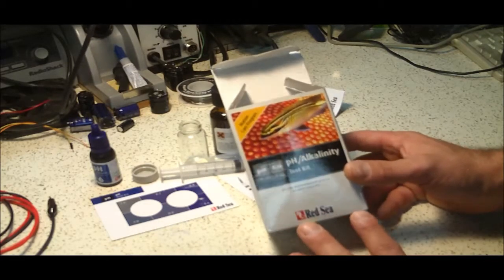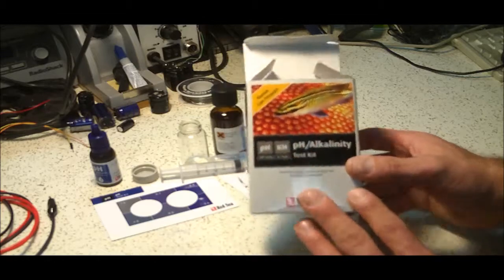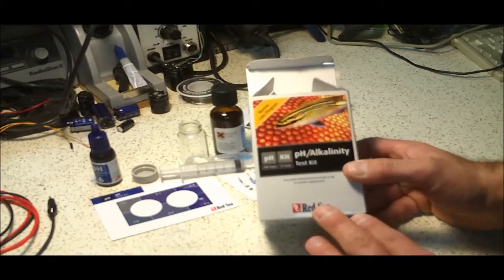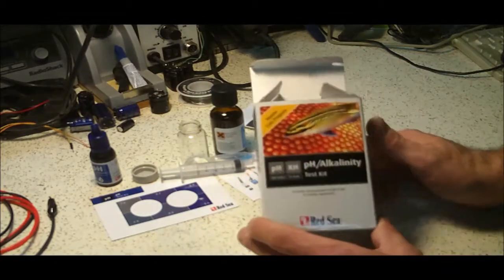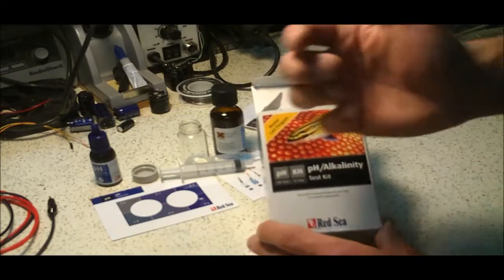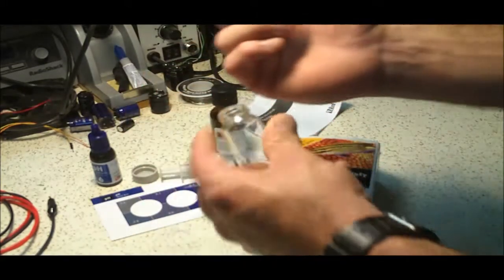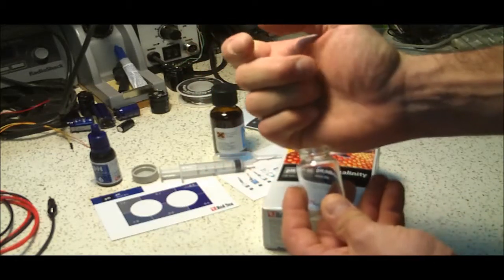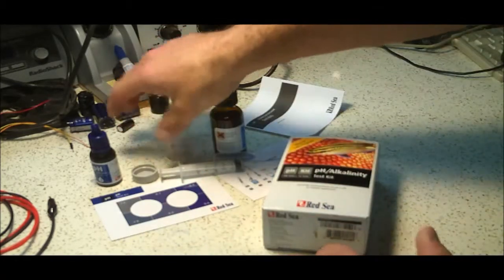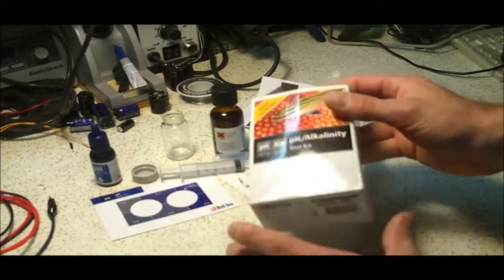I can't seem to find any pictures online of what you actually get in the box. They refer to the alkalinity test as a titration test and the only one I've seen is that little handheld unit where you screw the glass vial onto and you actually drip the titration solution in. Anyhow, that's not what you get in this box.